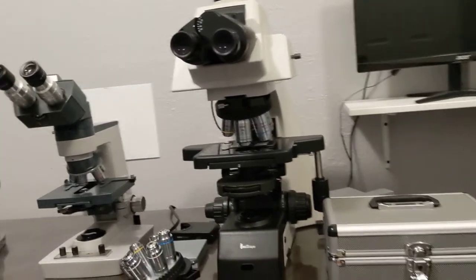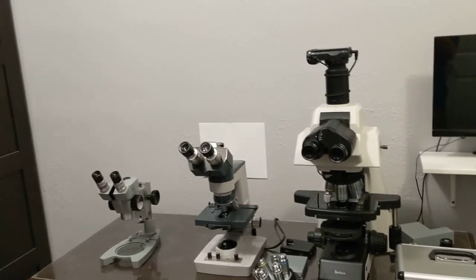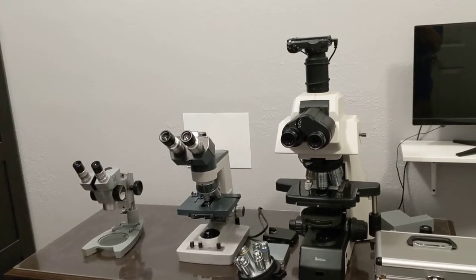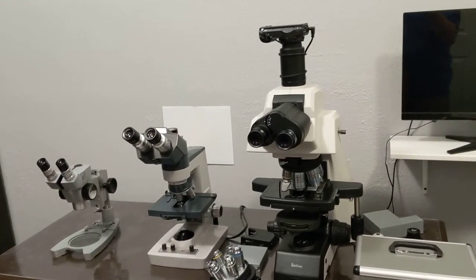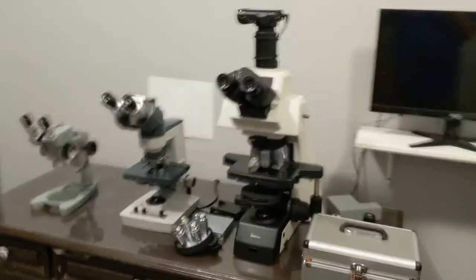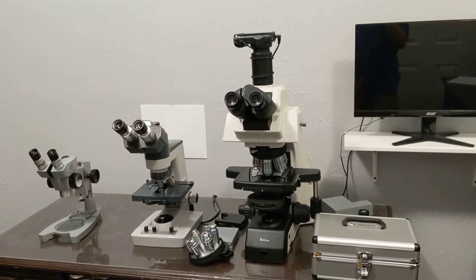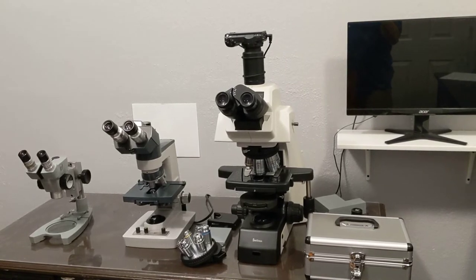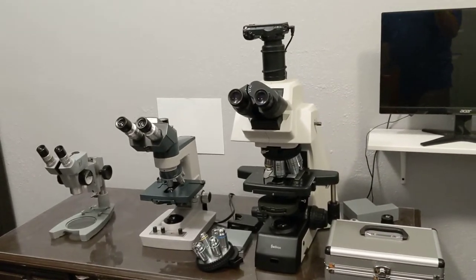Many things in the microscope world are outsourced to China, but the most high-end components are typically still made in Japan or Europe. It turns out that Nikon manufactures a great deal of their stuff at the Novel Optics Factory in China. Novel has used that same factory to build microscope stuff that's kind of on the same level with the same tolerances, and it's compatible with Nikon. You could think of this microscope as kind of a generic Nikon CI.